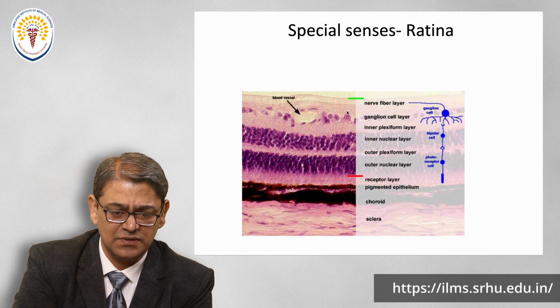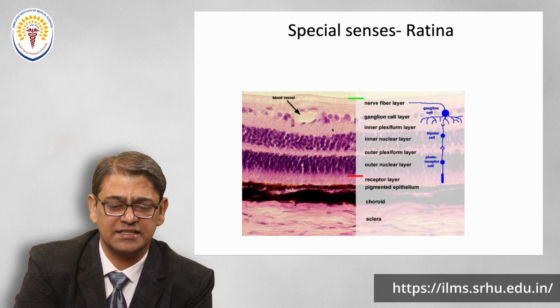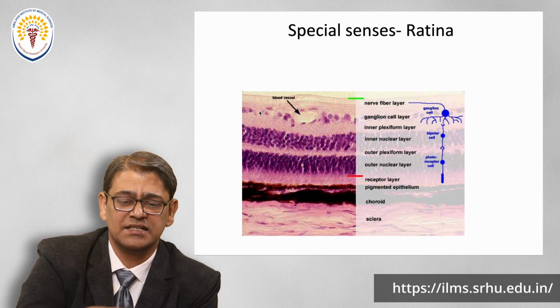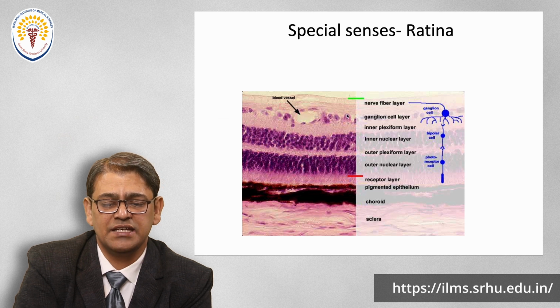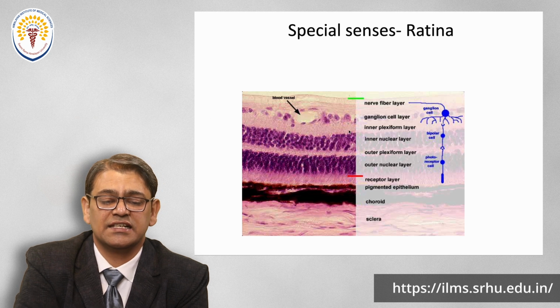This big nucleus is basically a ganglionic cell, and these are the dendrites of this ganglionic cell. So this is the ganglionic cell layer. The connective tissue is there, and then submerged in it is the ganglionic cell nuclear layer, and these are the various dendrites coming out of the ganglionic cell. On the other side, the axons come off this ganglionic structure, and from these axons the optic nerve is formed, right? So this is the ganglionic cell layer.